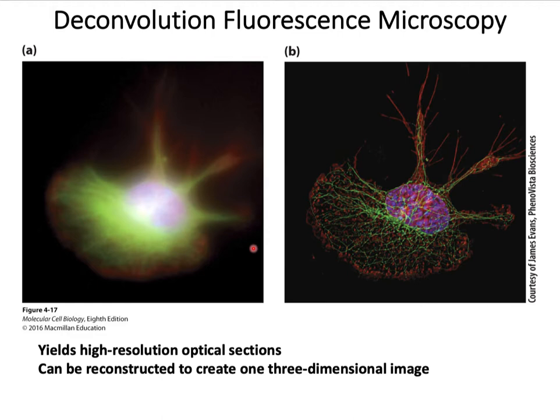So how does this microscope work to get a final sharp image? The microscope focuses individually on each plane and collects the optical data, or the fluorescence, from that plane only, and cancels all the noise or the out of focus light.